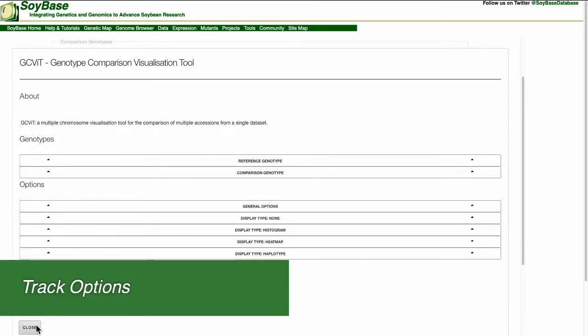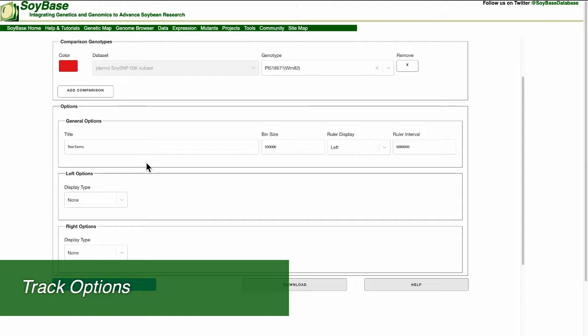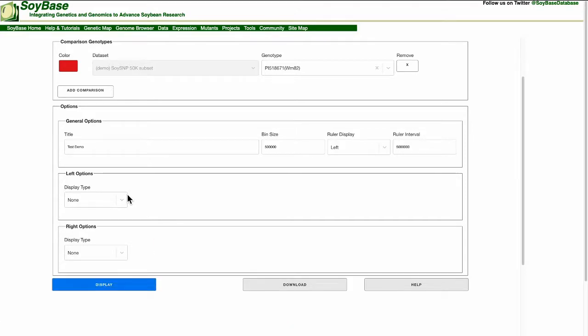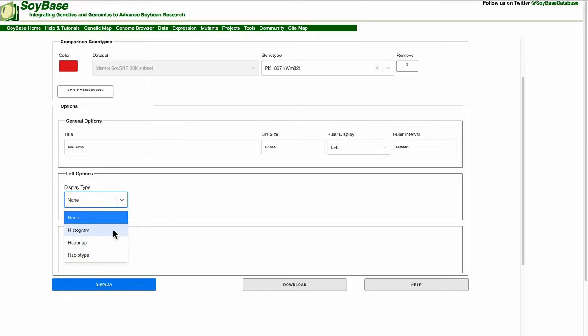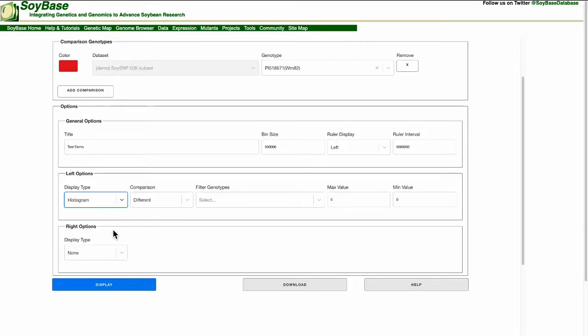The next set of options refer to what gets displayed on the left and right-hand side of the chromosomes. Both the left and right features have the same options. For display type there are four options. These four options include none, histogram, heat map, and haplotype. For this tutorial I am going to show the histogram. For more information on each display type please refer to the help documentation at the bottom of the screen.